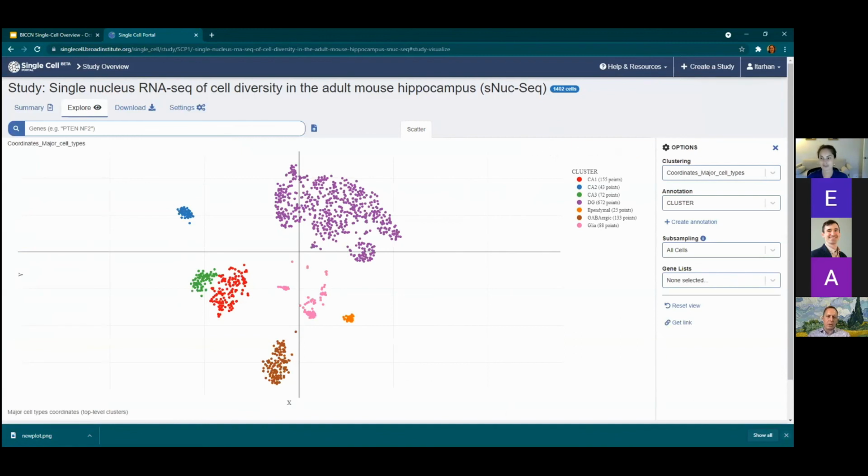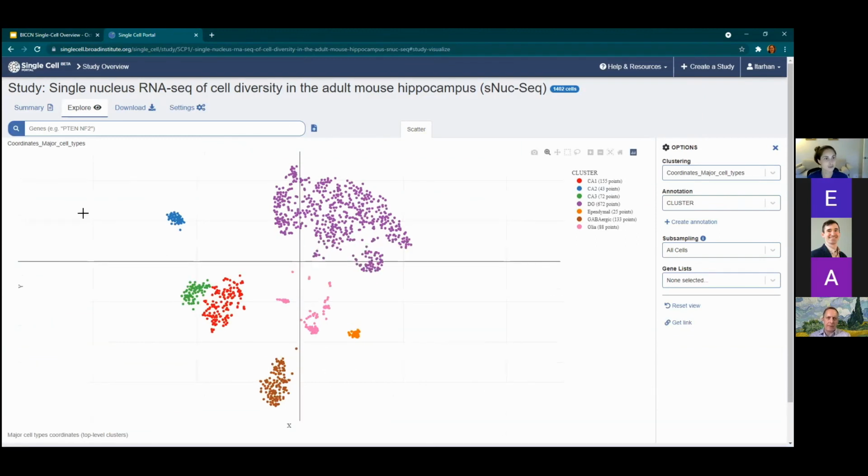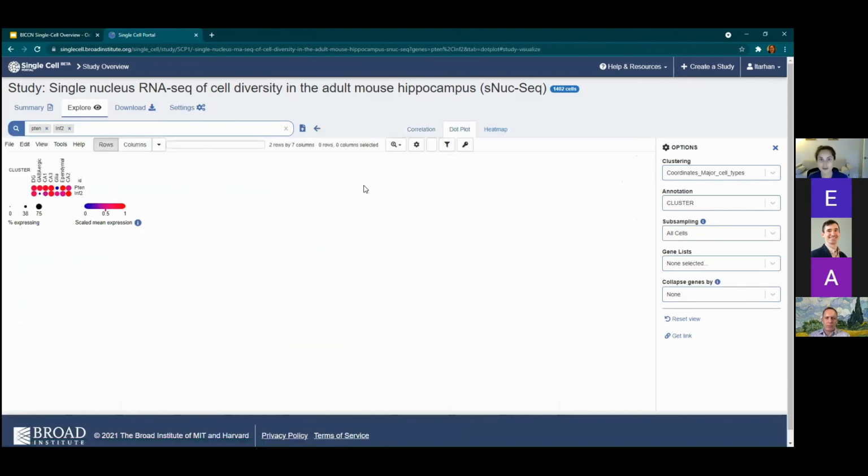Okay, very cool. And can you do the same for the dot plots and things that you were showing too, like if you're searching across studies and you wanted to save one of those dot plot figures? I haven't tried to do that, but I think it has a slightly different control, but you can go to save image. Oh, cool. That is possible as well.